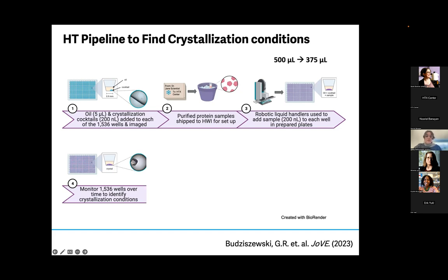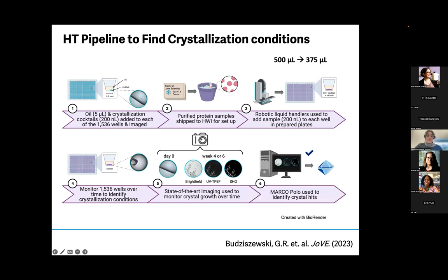So after setup, we do incubate your protein for the course of 6 weeks with weekly imaging. All the images are collected and transferred to our users via an FTP system that is also integrated into the Marco Polo software, like Ethan told us earlier. And we do highly recommend that our users make a first pass through their crystal images using Marco Polo. This can help you categorize your images into 4 categories, which are clear, precipitated, crystal, and other. And this really dramatically reduces the number of images that you need to analyze and the amount of time that you need to spend doing this.